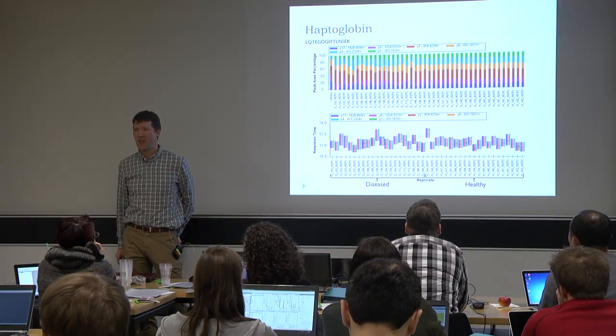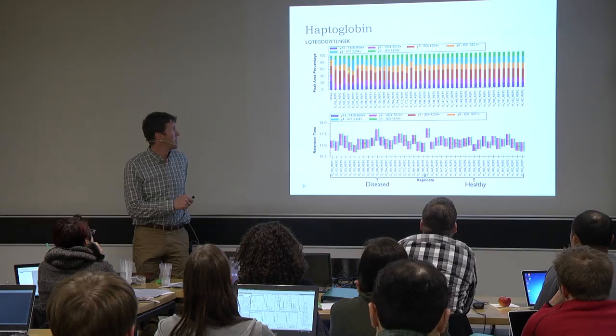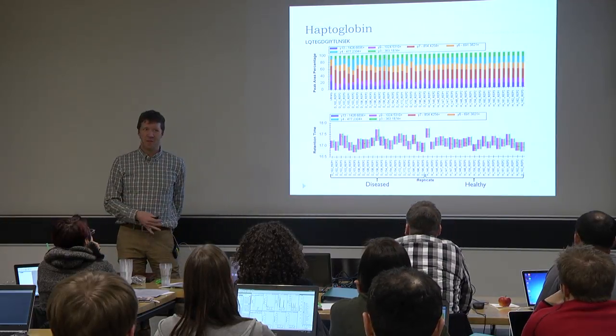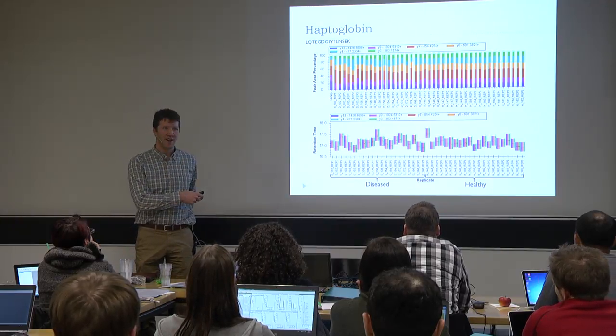Go ahead. In the disease, there are maybe 3 samples which look a little bit worse. So one could check whether there's some interference or something else. Okay, so maybe this one, this one, this one. And then generally there's more variance over on this side and less on this side, right?